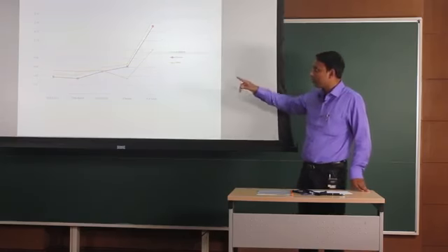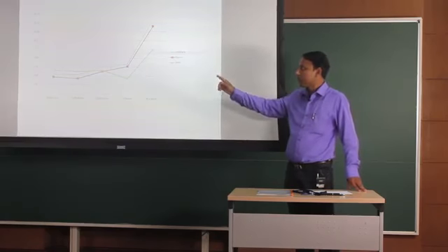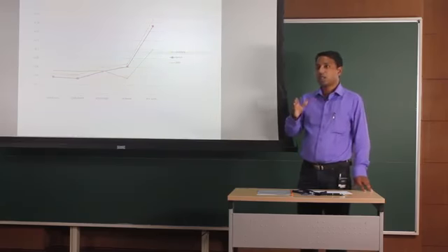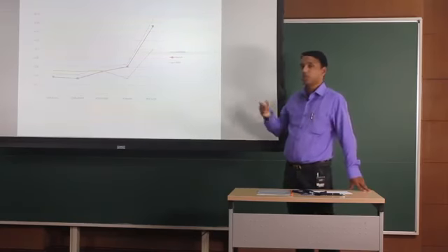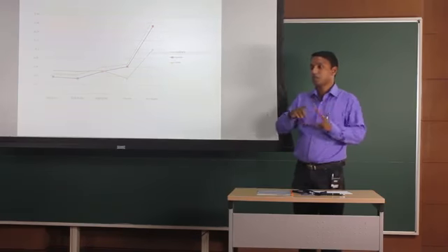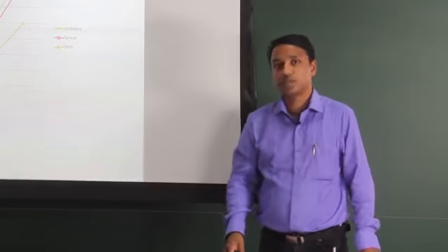There is a problem that we have got in that graph: in the first part of the graph we got some different readings. It may be because this project was carried out for months, as we started in August and finished in December. During this period there was a climatic condition change, and because of that the oxalate ion concentration may also differ.